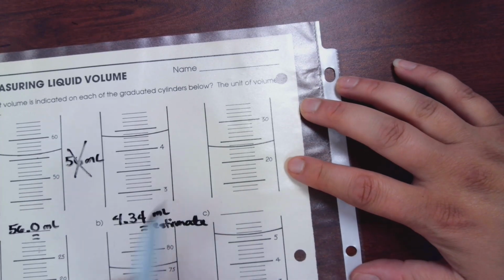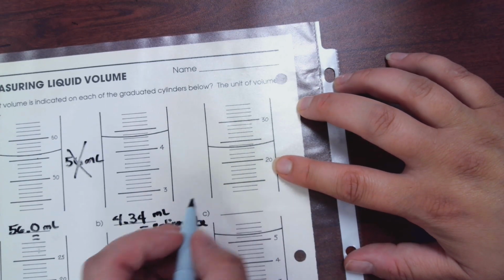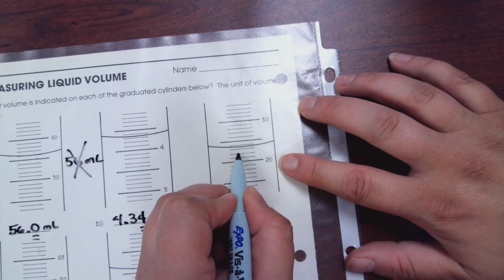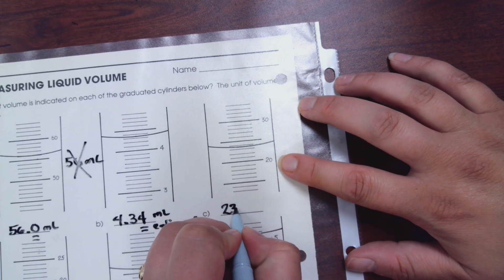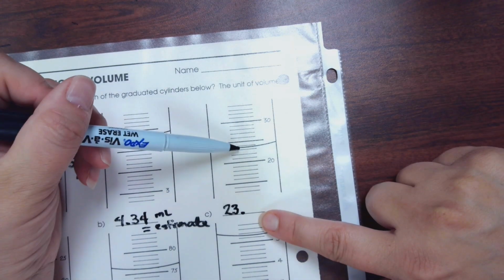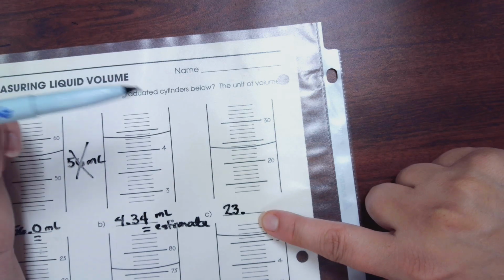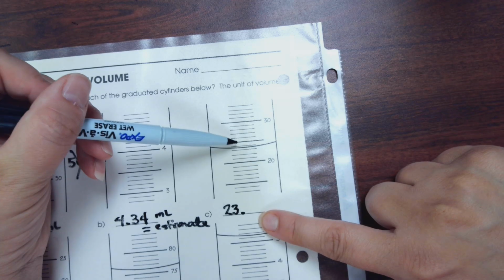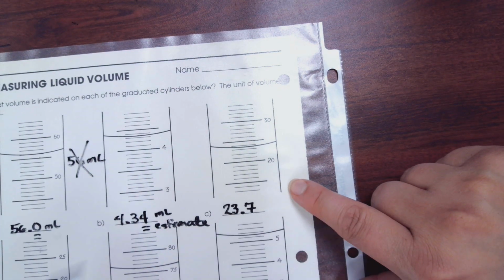All right, let's do one more of those. So here's our water line. It's above the 20, so I'm going to put 20. And then I'm going to count 21, 22, 23. It's between 23 and 24. So I'm going to put 23 because we're not quite to 24. That's where my decimal would go. And now I'm going to estimate how far between those two lines is this. Now this one looks about halfway, but this time it seems a little higher than halfway. So I would maybe go as high as 7 on this one.